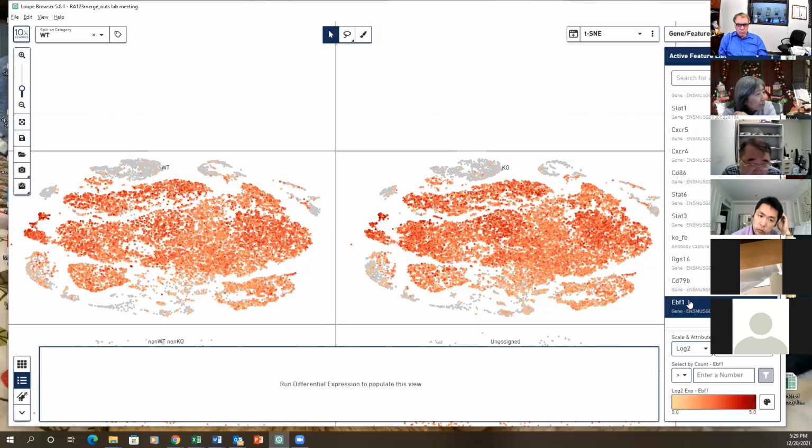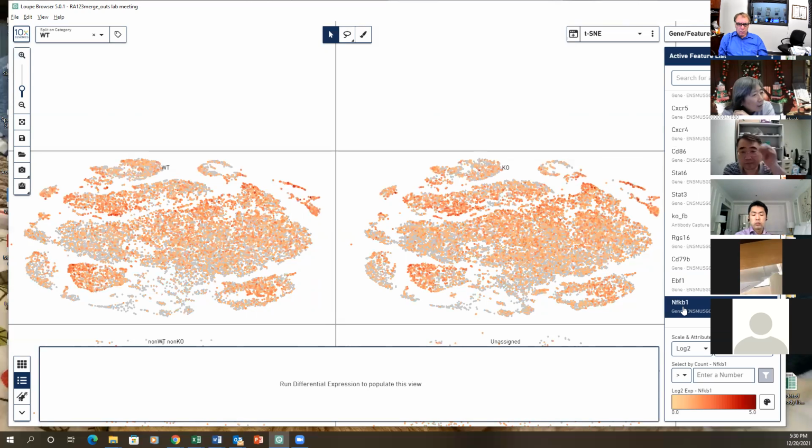How about NF kappa B1? Similar too. It's just hard to see any good difference.